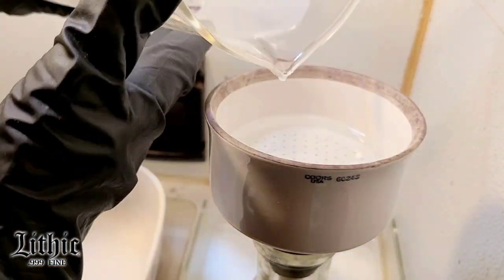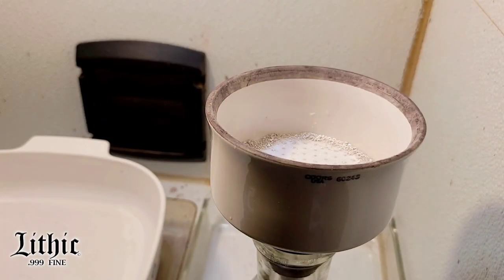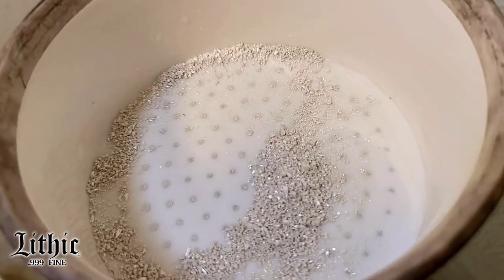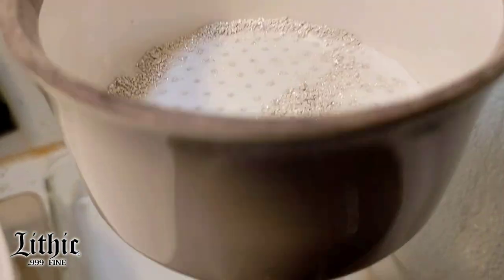Now I'm going to filter that solution to make sure it's clean and get all that remaining silver crystal particles out of there. We just got just a little bit left, but that's perfect. I'll set that aside and process it again later.